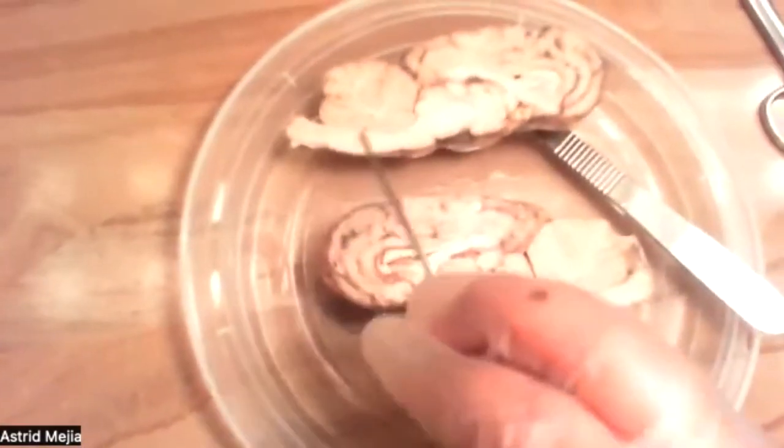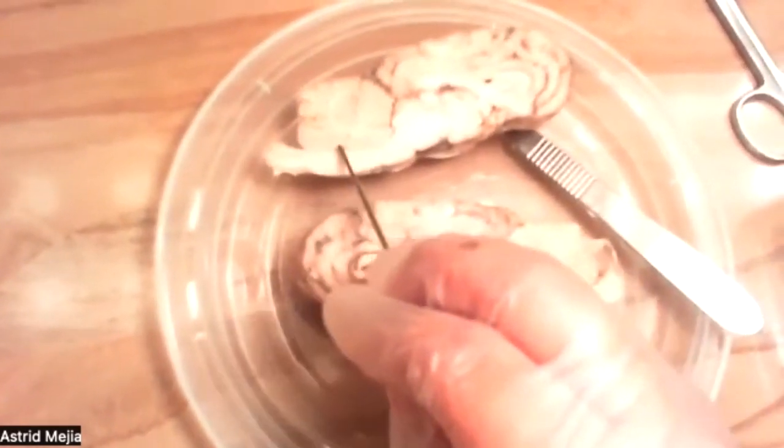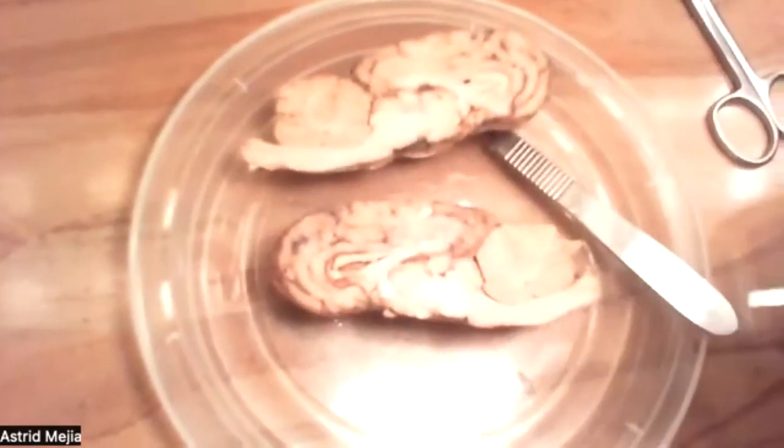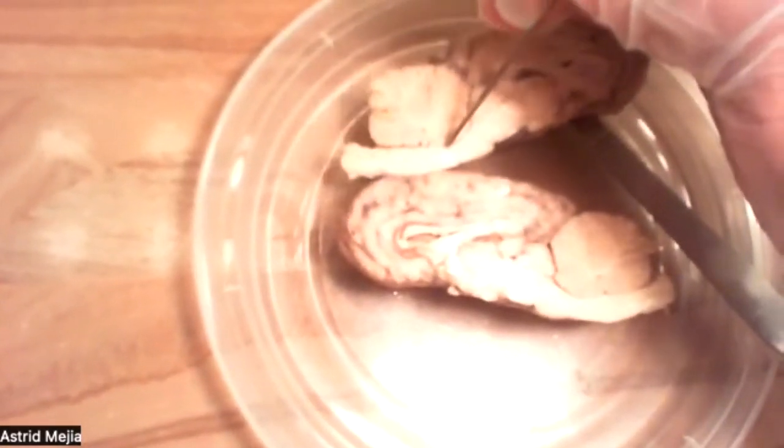And for another structure, it will be the fourth ventricle, which would basically be located right here. It's going to be the little gap right here.